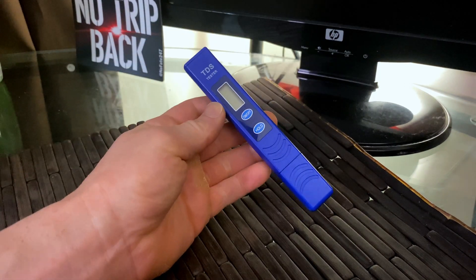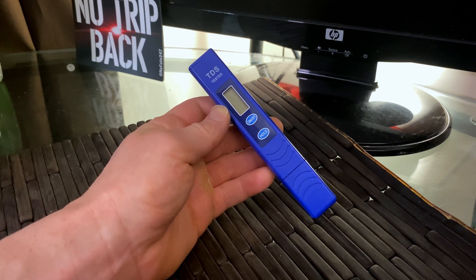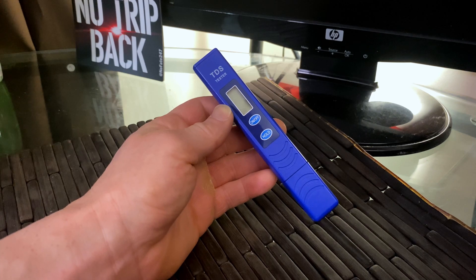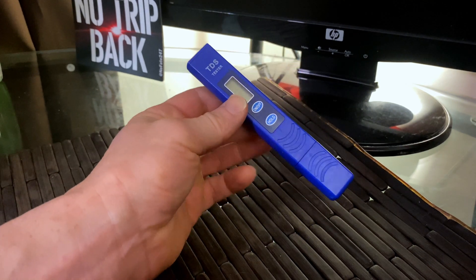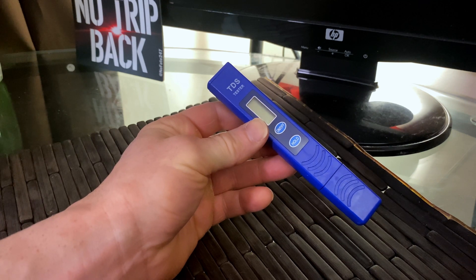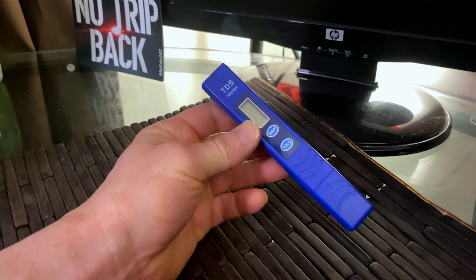As I've mentioned in previous videos, what gets measured gets managed. So if you want to make sure you have high-quality water for yourself, your family, your kids, and your guests, make sure you get a TDS meter so you can measure the quality of your water — not only at the tap, but out of your filter system. If you have a filter system, you should be measuring it as well to make sure it's living up to your expectations.